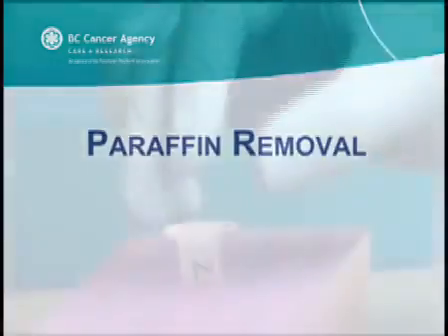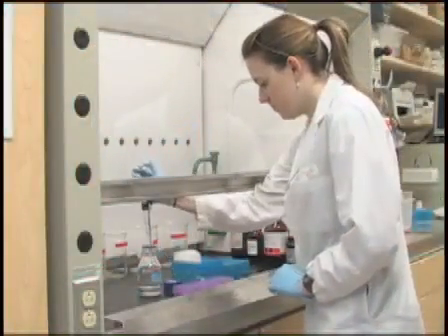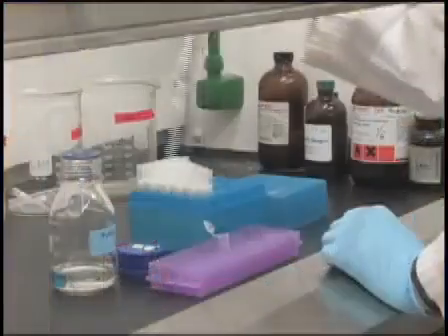Before anything can be done to the tissue, the waxy paraffin preserving the tissue must be dissolved. This is accomplished with the use of xylene. As xylene and phenol are toxic, any work with these chemicals should be carried out in a fume hood.